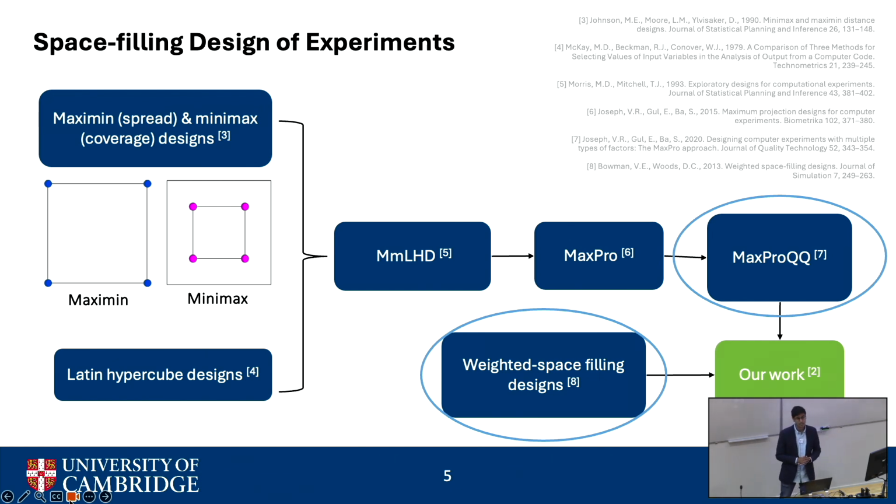And then I took inspiration from this idea of having a weighted space-filling design, where weighting is meant to minimize sampling in regions of little relevance, and as I alluded to earlier, this was the unstable regions. So we tried to direct the experiments to predicted stable regions, and as we do not know a priori which these stable regions would be, we're training a stability classifier in an active learning cycle. And also in this work, we introduced a featurization by the surfactant functional groups. So we're trying to move towards having more generalizable property predictions.